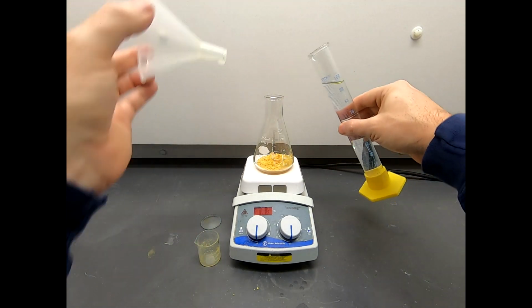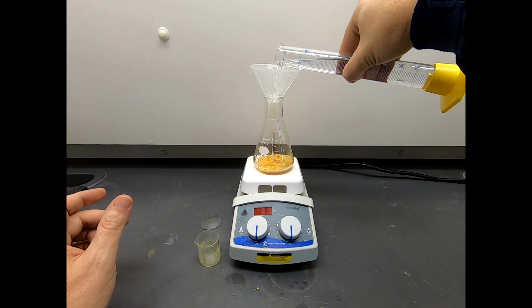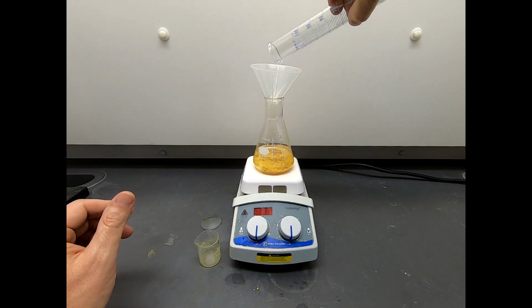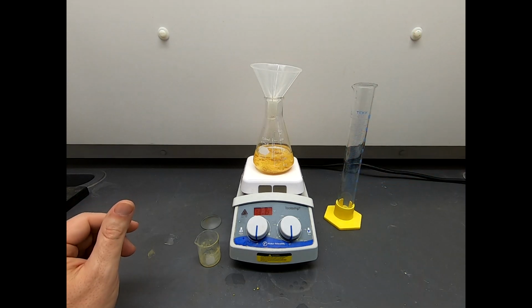Let's go ahead and take this 100 mils. Oh, let's put it through here, just in case we get a couple crumbs to rinse through. That's good. Now our product is just floating in a really dilute acid solution.